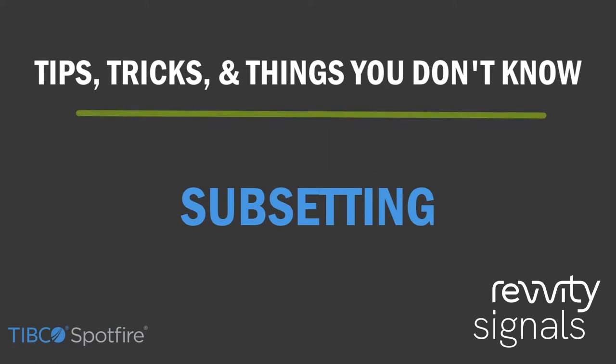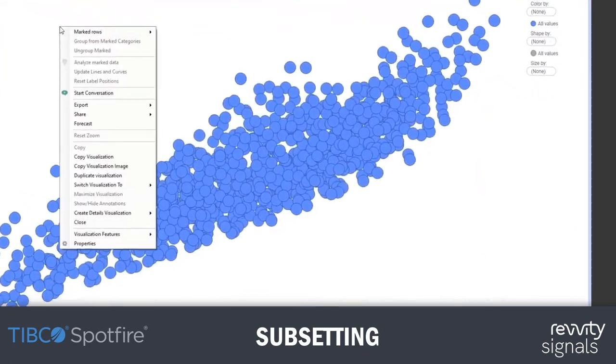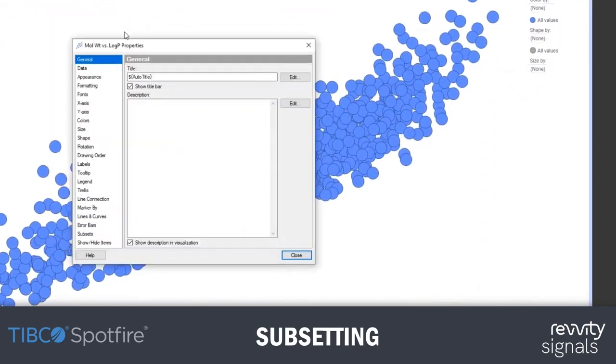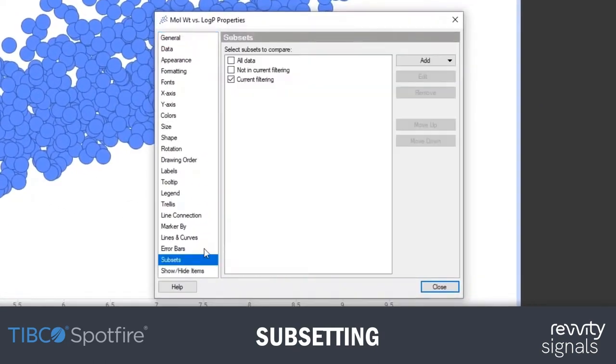Something I wanted to talk about was subsets. Subsets have been around for a while, definitely in 7.11, and I think a bit prior to that. You can find them in any visualization, so they're visualization specific. When you go to the properties of a visual, right down near the end of the list, you'll see subsets here. And the default is the current filtering.